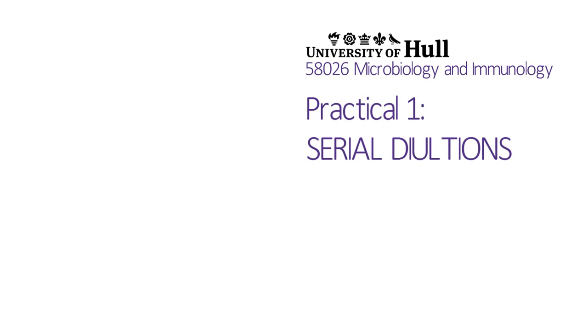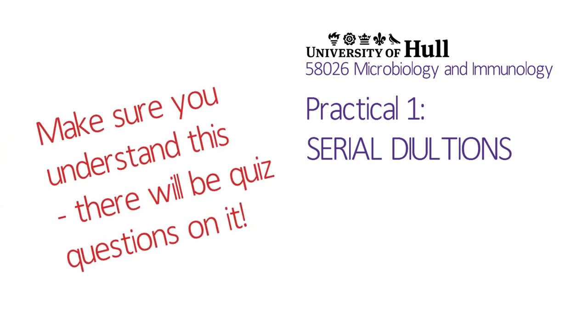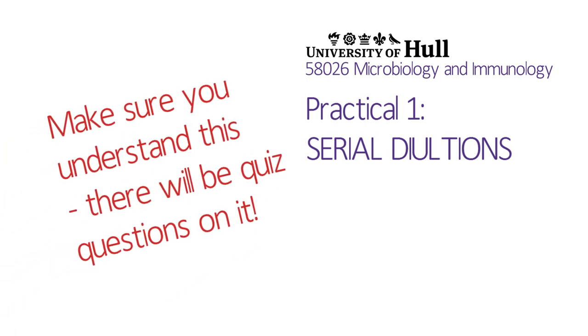Make sure you've understood how serial dilutions work before you take the pre-practical quiz. There're going to be questions on this important technique in there. Rewatch the video as many times as you like to make sure that you've really understood it.